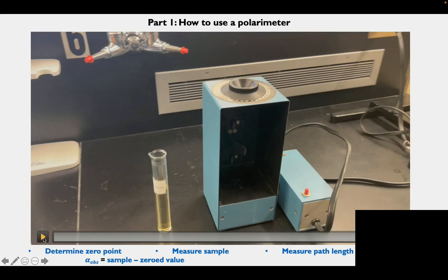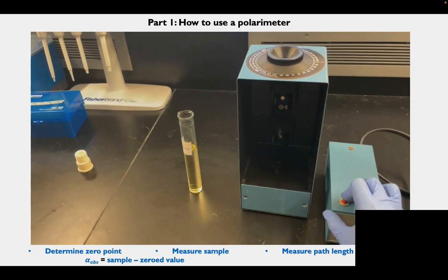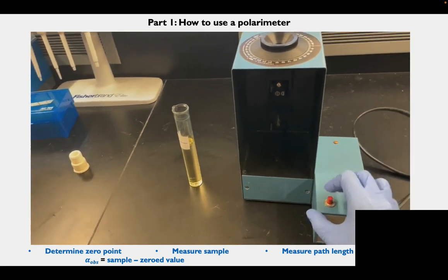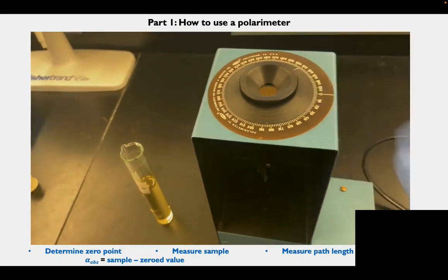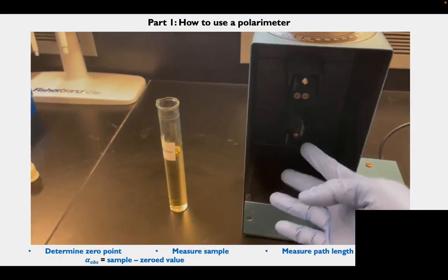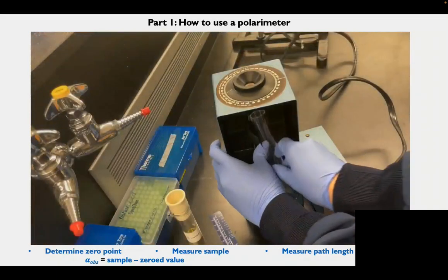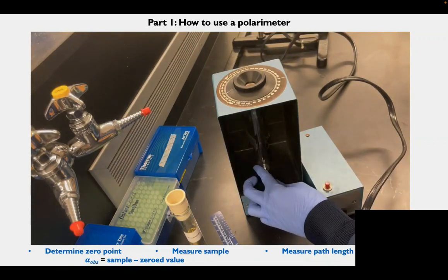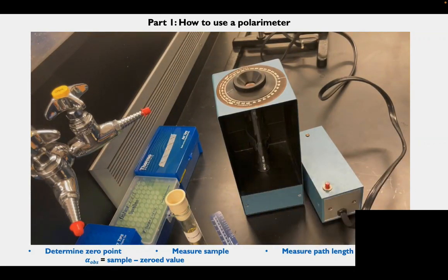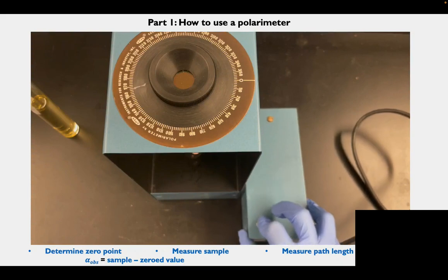So this is what our polarimeter in the lab will look like. Here is our lamp or our light source, and then the dial that you can rotate, and then at the top to see the appearance of light passing through. And here is our sample holder. So you want to first determine the 0 point. This is just the standard or the solvent. You will place the cylinder containing your solvent in the sample slot holder, or leave the polarimeter empty if your sample is a pure or neat sample.